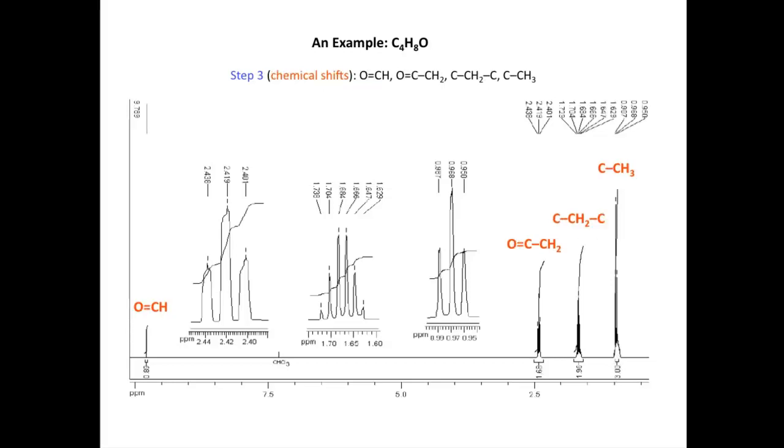In step three, we're going to use chemical shifts now to identify fragments or partial structures that could be present within the molecule. If we look at the highest chemical shift value first, this one up towards 10 ppm, that's characteristic for an aldehyde hydrogen. If we look at the signal towards 2.5, that's characteristic for a CH2 adjacent to a carbonyl. Near two, it's characteristic for an alkane CH2 in between two saturated carbons.